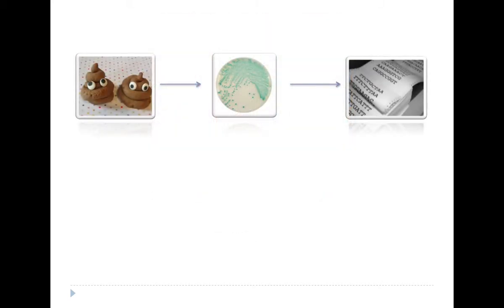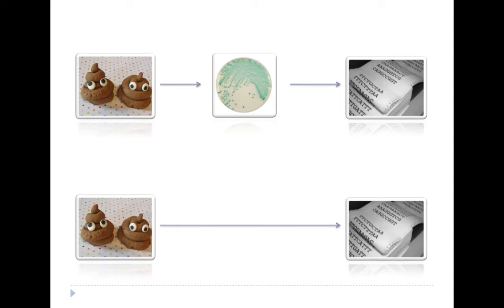So the idea was, when we did our first study, we went from the fecal samples through to a plate, we picked the colonies and then sequenced it to get that genome. Could we go directly from the fecal samples to getting sequence that would allow us to identify and characterize the outbreak strain and maybe other things as well?